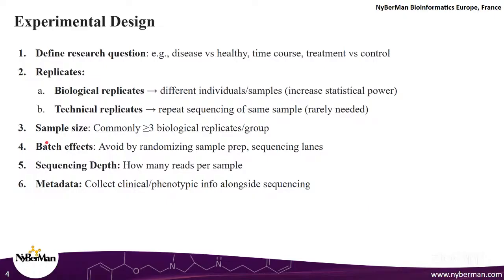The next thing that you have to consider is the sample size, namely of the biological replicates. That is, how many biological replicates do you want per group, right? For example, a few minutes back, I mentioned 5 people having rheumatoid arthritis and 5 healthy people, or my control group, basically, right? So that means that I am using a sample size of 5 plus 5, which is equal to 10, or a sample size of 5 per group, right?